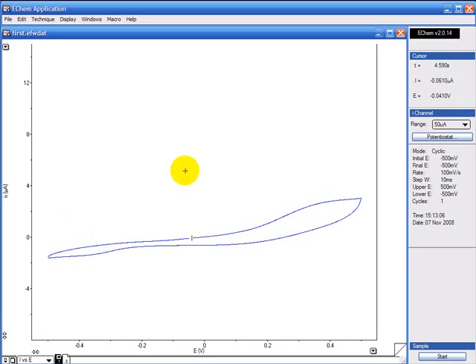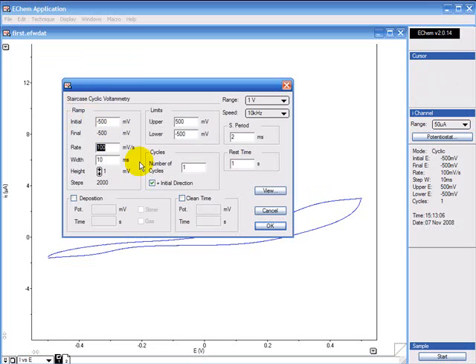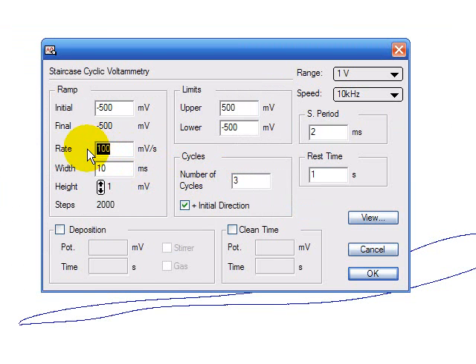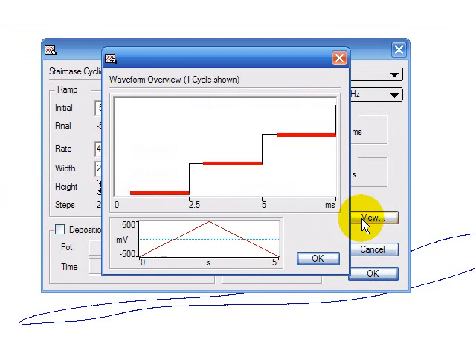I'm going to show you now how you can do several runs. You go to technique, cyclic voltammetry. I'm going to do three cycles and I'm going to increase the rate to 400 just so you can see what's happening. If I click on view, you can see now it's going to take five seconds to do each cycle.